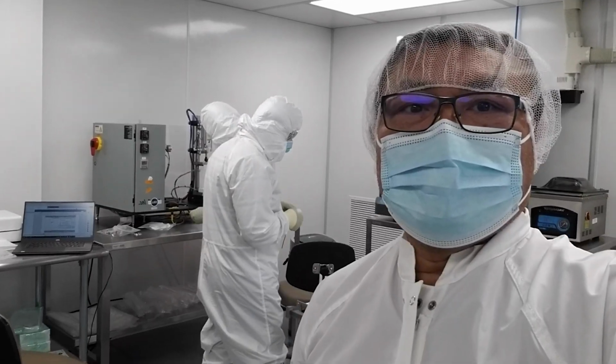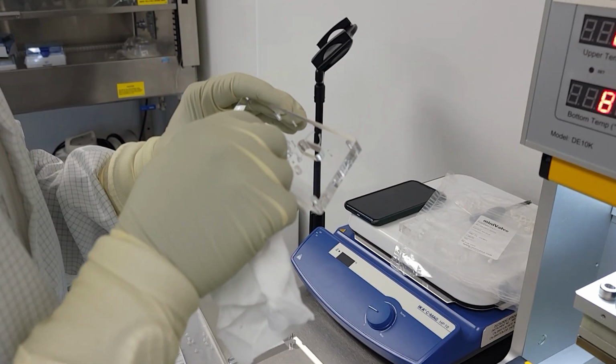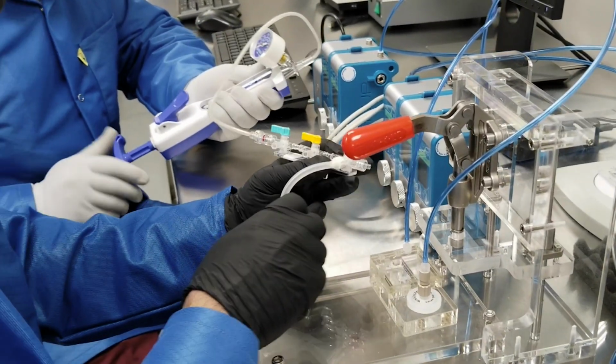For biologists and bioprocess engineers like me, we spend most of our time doing cell culture, process optimization, and in some projects, small-scale manufacturing. Utilizing microfluidic technology for biomanufacturing is an advancement in developing or testing new biomolecules or biologics for a variety of medical uses and therapies. One of the promising microfluidic applications for biomanufacturing is the production of cell line in a parallel system. Considering the ability of microfluidics to manage small volumes at the level of a single cell.